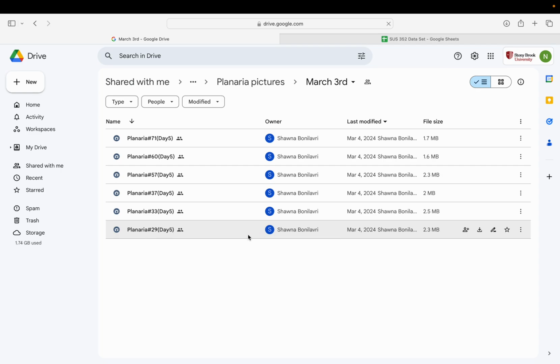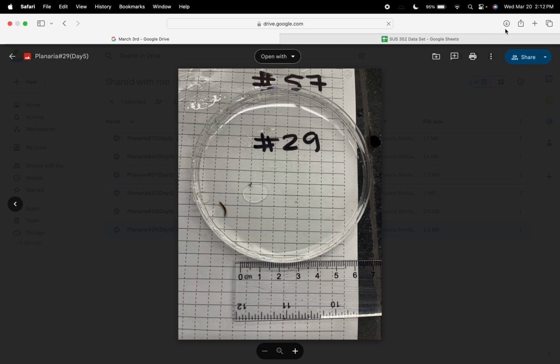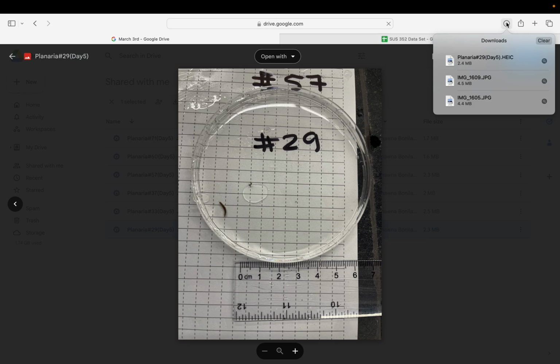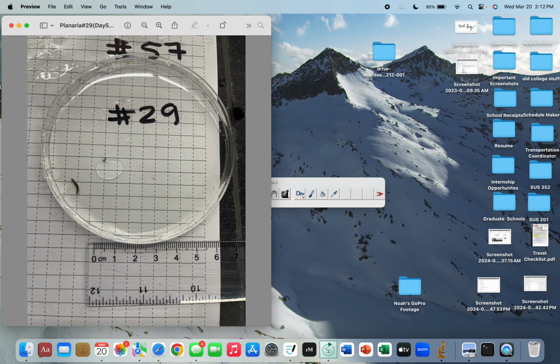But I'm just gonna show it anyways because people are gonna need to know how to convert the file, which is pretty easy. I'm just gonna click this file and download it. I already downloaded it earlier because this is like my 8th attempt at this video. So I'm just gonna open this file up, and here we do see it's the HEIC file, which is no bueno. We're just gonna need to convert it real quick.